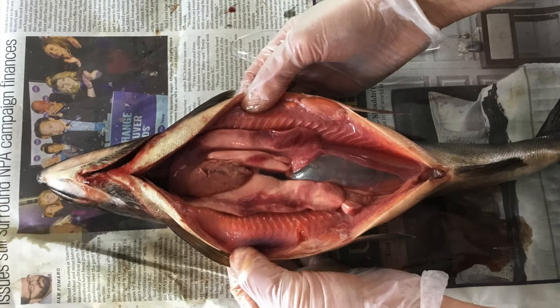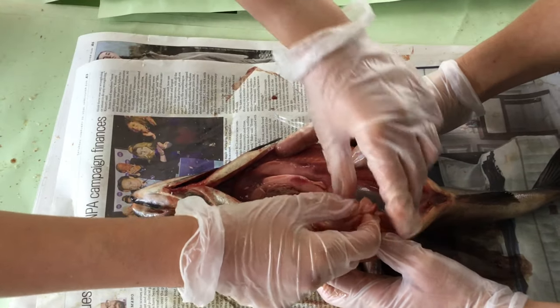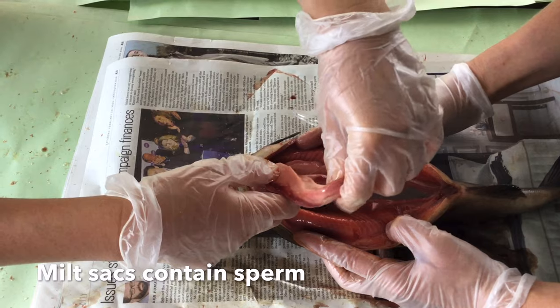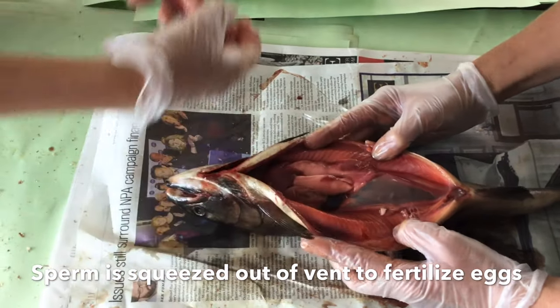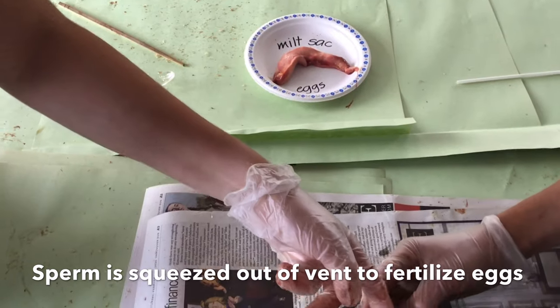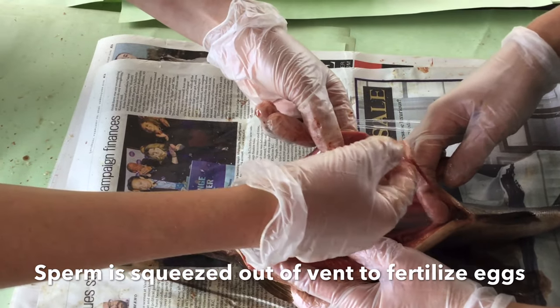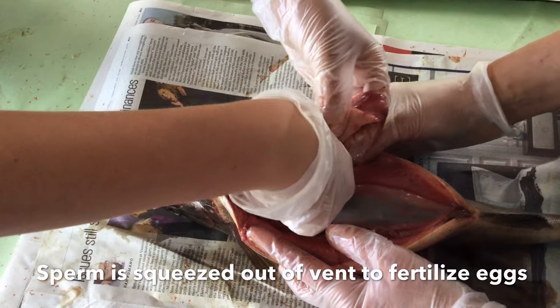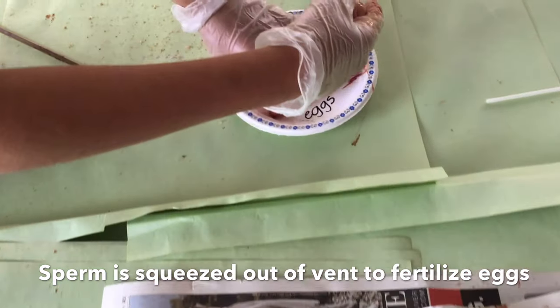No, I'm going to hold it. Okay, so the two testes, or milt sacs, are coming out. They contain sperm. And when spawning occurs, they're squeezed out of the vent to fertilize the eggs. Delicate operation. That's where it attaches to the vent. Oh yes, there's where it attaches to the vent, and the sperm would come through the vent, through that tube, out the vent. There we go. Milt sac. Two of them.